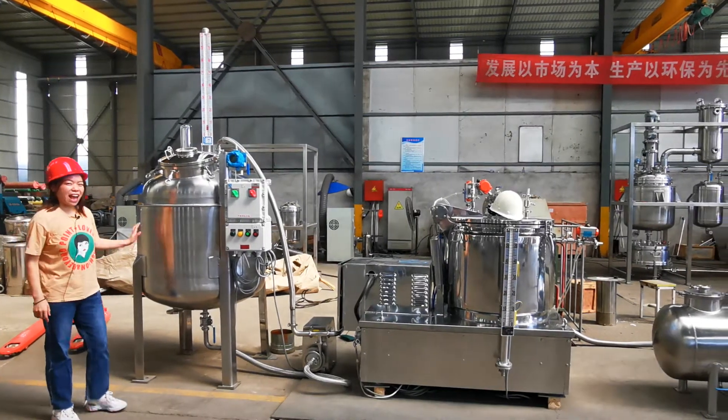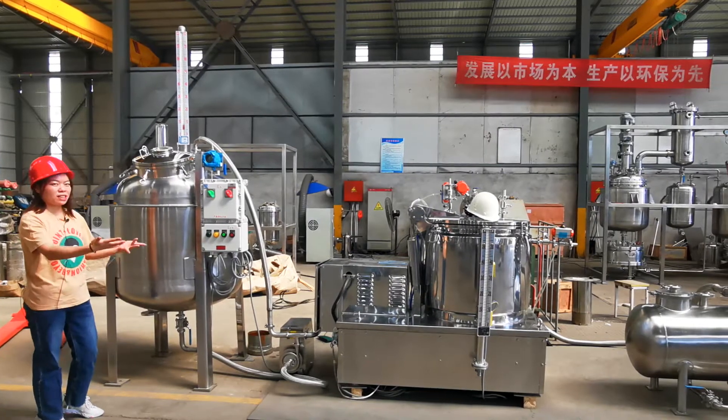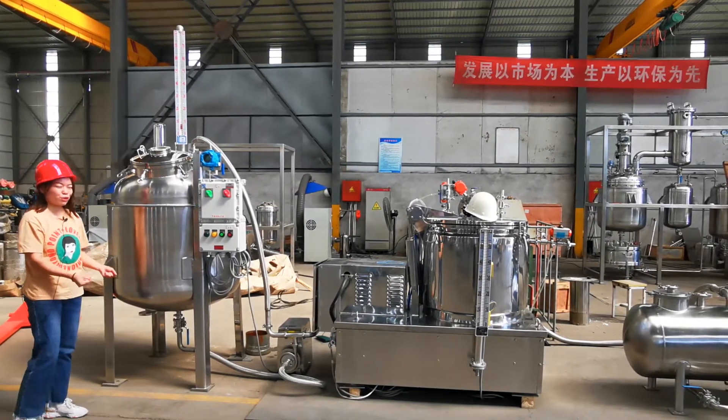Hey, hello, this is Alice from Topshen. Today I want to introduce our CBD extraction line to you.